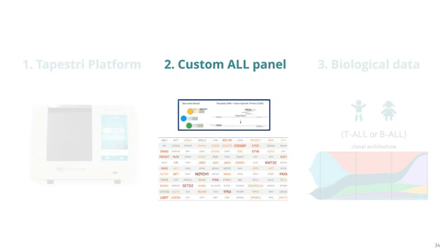data. And I have to say that this panel is currently available as a pre-designed option, so that you can start the design of your panel with this set of genes and also remove or include some other genes. Mission Bio is also planning to make it commercially available very soon.